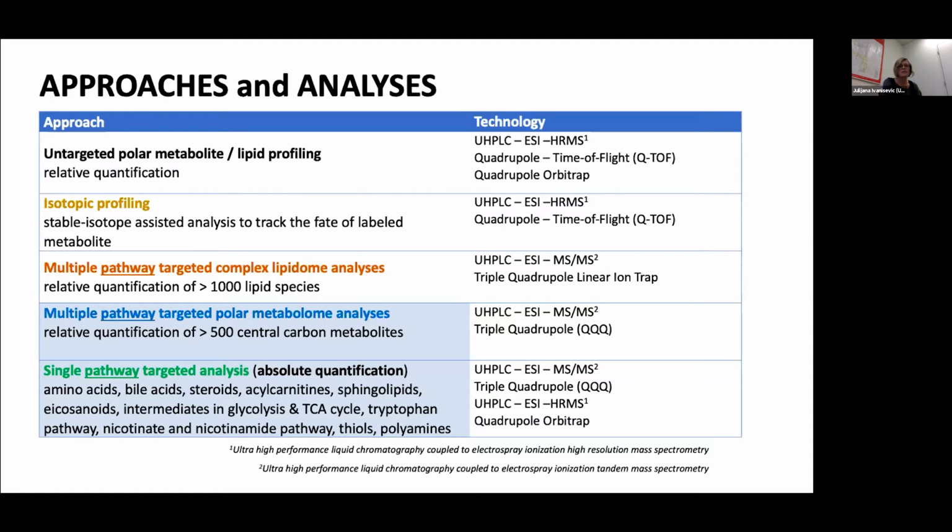We have developed several methods to target as many metabolites as possible, as an alternative to untargeted analysis.